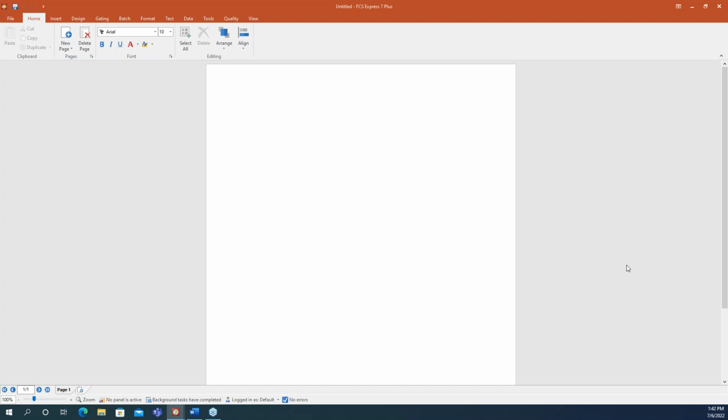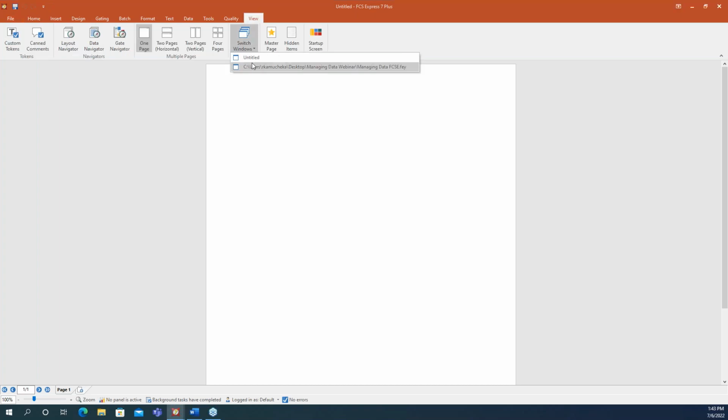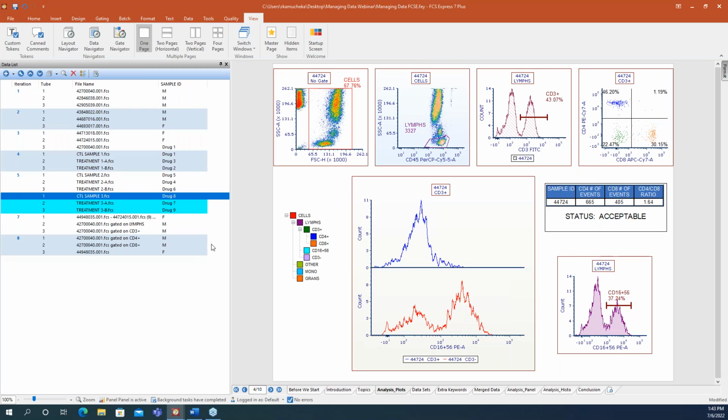And I'm going to take another look at our question box here. Oh, okay. I see a great question from James. It's, can you make user keywords global? So right now we make our keywords to be consistent with the data files that we are working with, meaning we use the file names as an identifier to add those extra keywords.